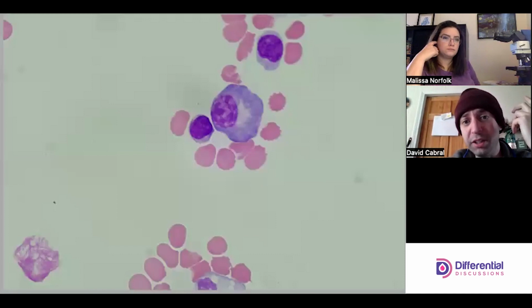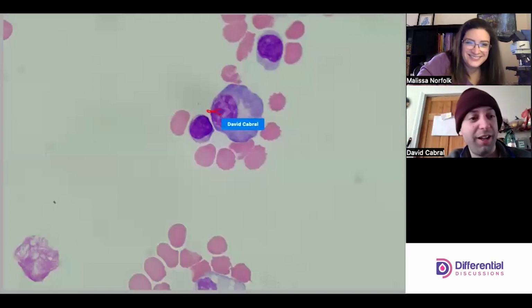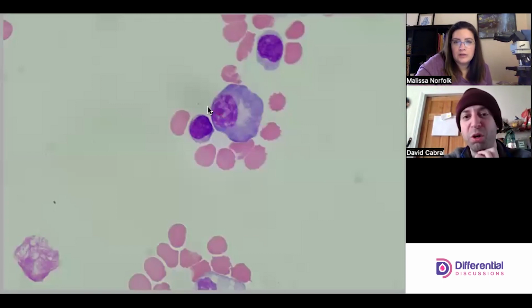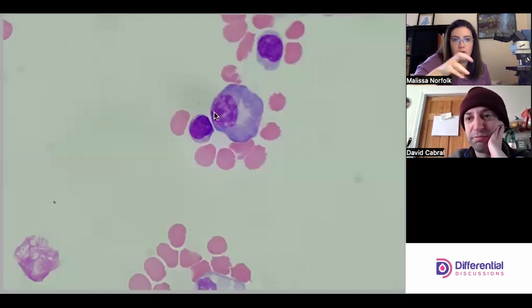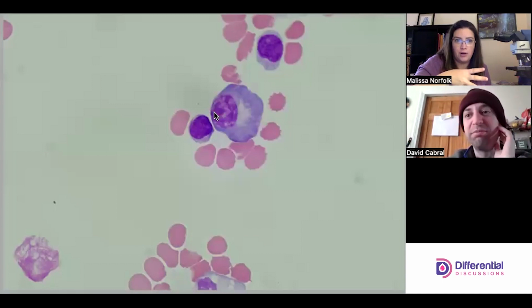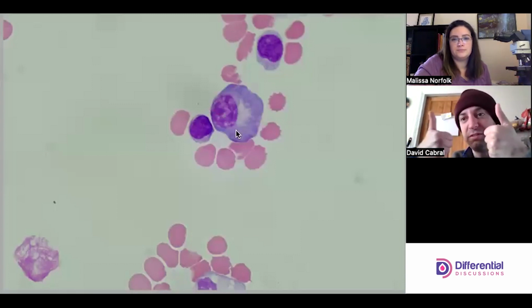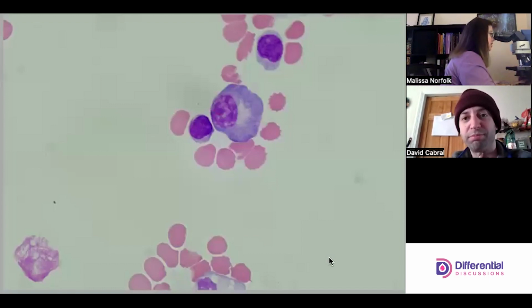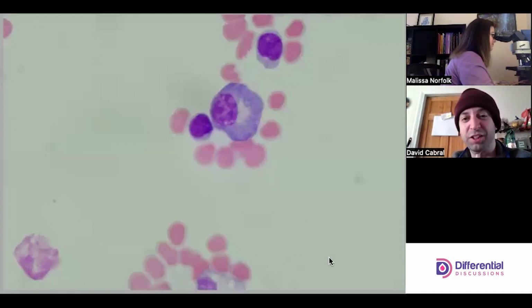You tend to have these areas of deep, dark clumped chromatin, with really prominent white striations. They're very prominent. This is just very good. The perinuclear halo is gorgeous. I just wanted to look at him. Now we can keep going.